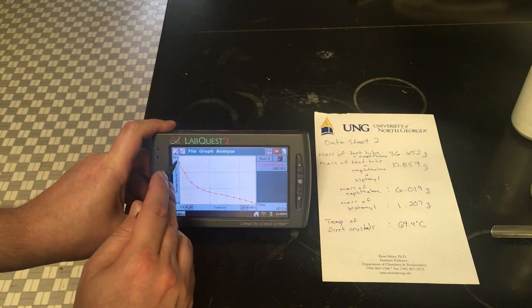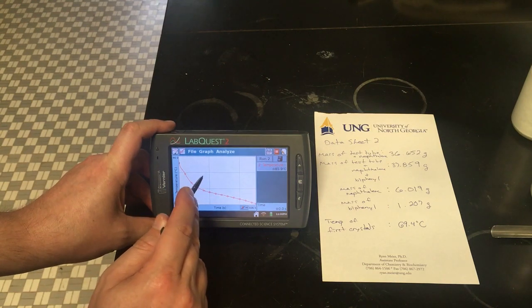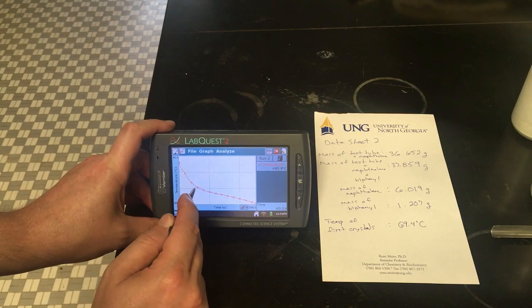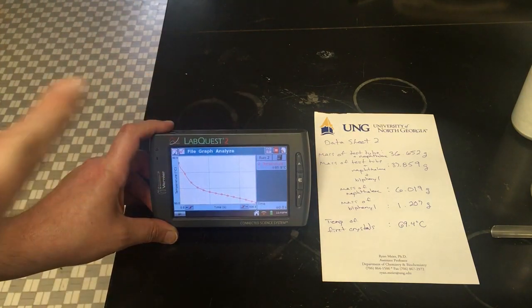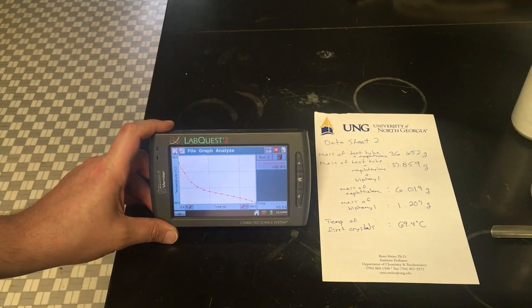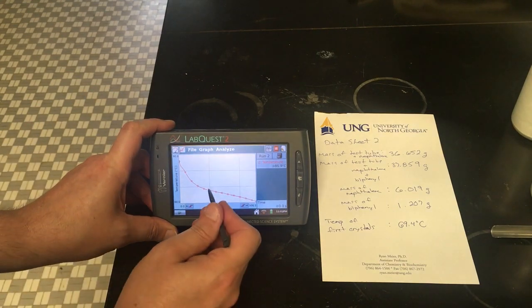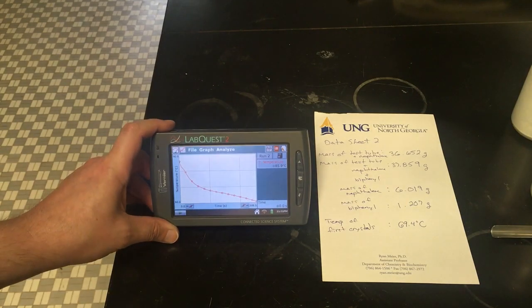But it looks like if we're looking here, our temperature is pretty constantly decreasing. And then all of a sudden, we don't see a spike back up, but we do see it pretty heavily plateau right in here. So we're looking at a freezing point that's somewhere right in here, about where you think it's starting to plateau the most. There's obviously going to be a little bit of interpretation here, so you're not expected to get this exactly down to 1 decimal place, just within reason. Somewhere in this range temperature-wise is where that freezing point is going to be this time.